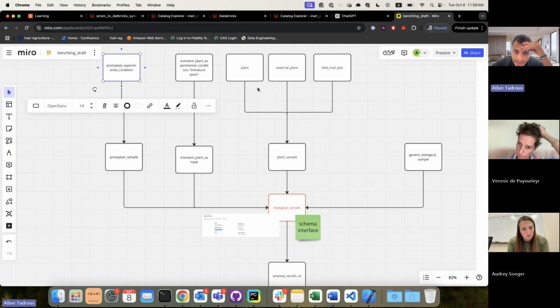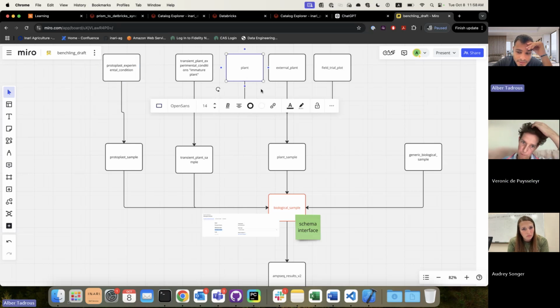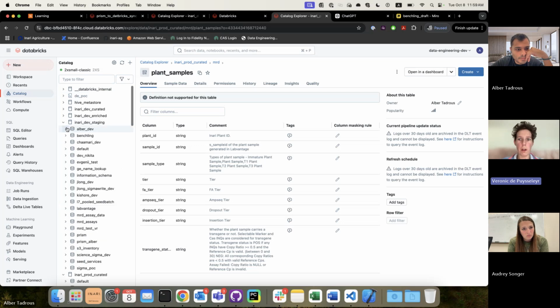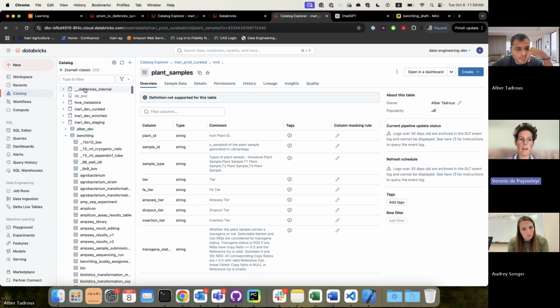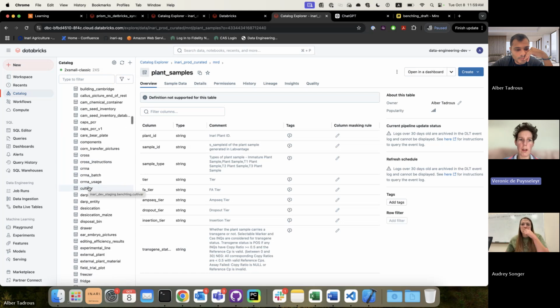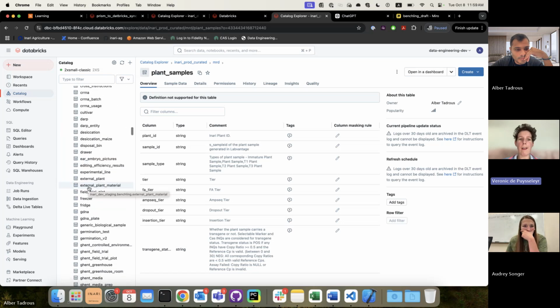Okay. And how can we get this information in the plant? Where can I find it? So on the plant, there will be TACMAN results published. In your schema, it's qPCR. And in ours, I think it's the copy number result schema.